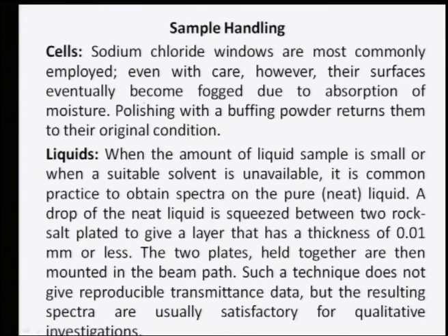Liquids which can be there. When the amount of liquid sample is small and a suitable solvent is unavailable, many times you can use the pure liquid of that compound without solvent.